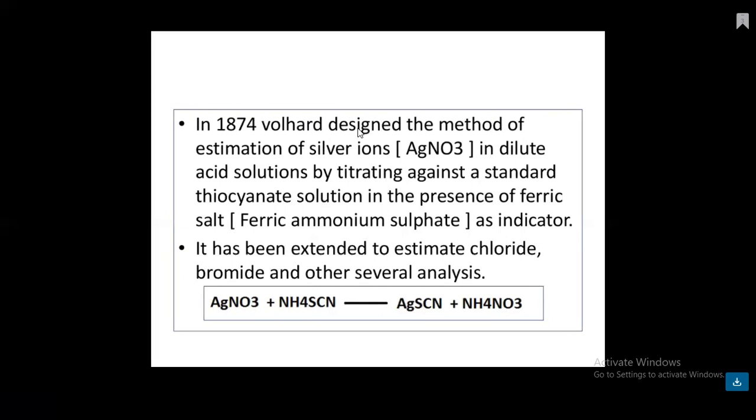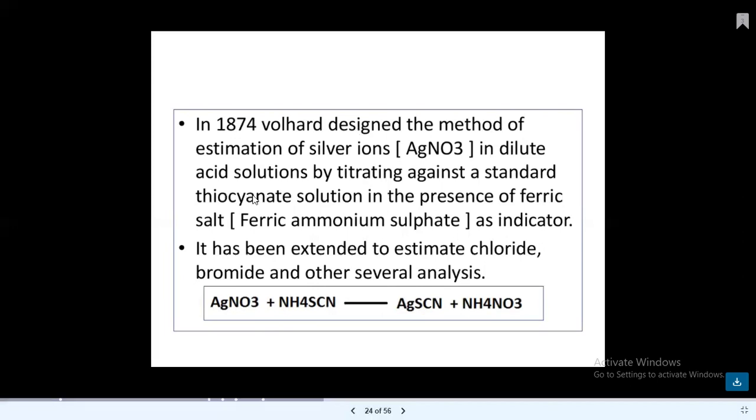Excess of silver ion, that is our titrate, in dilute acidic solution, by titrating against a standard thiocyanate solution, in the presence of ferric salt, ferric ammonium sulfate as an indicator. It has been extended to estimate the chloride, bromide and other several analysis.